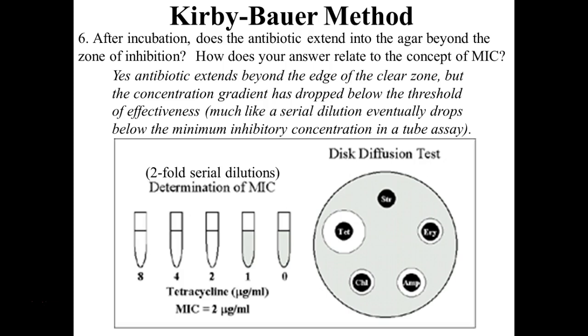All right. Okay. So sometimes you could do individual dilutions, right? This is the concentration of the antibiotic. And you can see, of course, at zero concentration, the control, it doesn't kill the bacteria, it's cloudy. At 1 microgram per milliliter, it's not killing the bacteria. But at the lowest concentration of 2 micrograms, for this particular example, they're killing the bacteria off. So that would be your minimum inhibitory concentration.